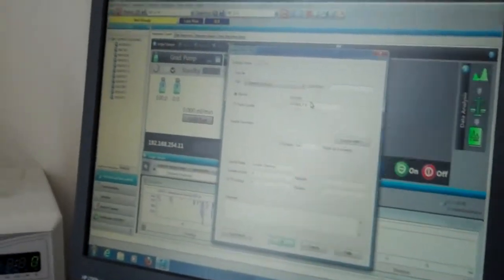Data file naming, this is tricky. Make sure you go over this with anybody who's going to use this. Manual: you have to rename that file name every time you run, or it's going to overwrite. It'll warn you first. It'll say data with this file name already exists, will overwrite the data or something like that. You have to hit OK, or you can hit no or cancel. And it'll abort the startup.